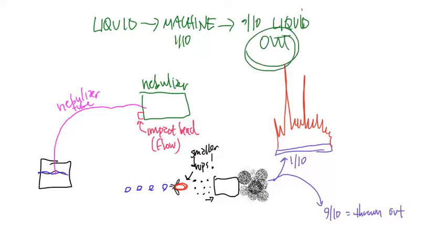Over here to the side of the burner head, you will see a drain tube. That's the purpose of the drain tube. It helps get rid of all of that liquid that never makes it to the machine to be analyzed. Which means that there better be a bucket down below to catch all of that liquid you're wasting.